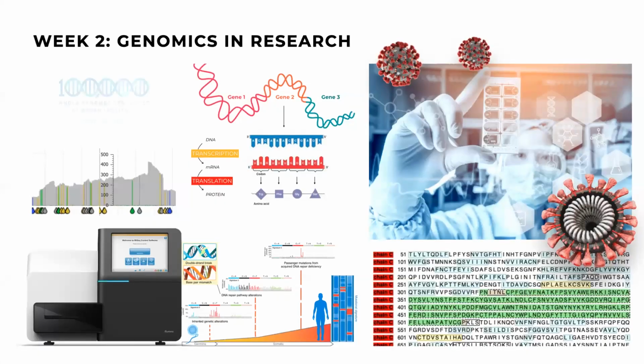Okay, so we will continue speaking today, and let's just review briefly what we talked about last time. We have quite an agenda for today and for the next few days. So we'll talk about how to generate next generation sequencing data, what types of formats for next generation sequencing data we have beyond FASTA files, which you're already familiar with.